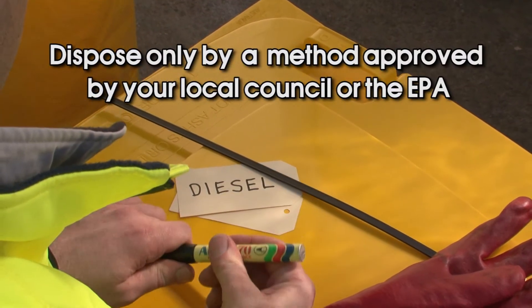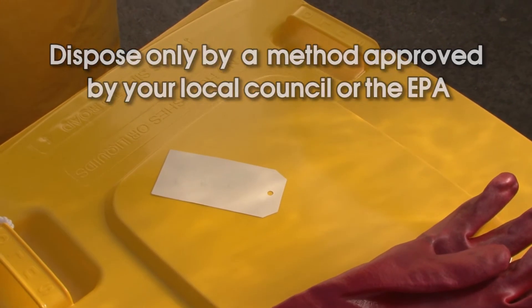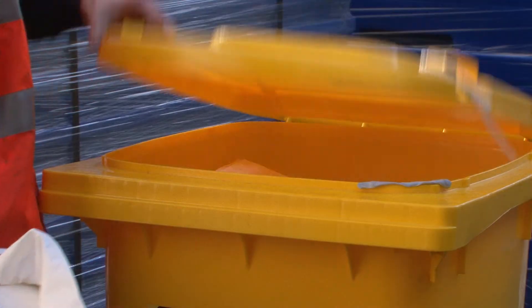Remember, you should only ever dispose of contaminated material in a method approved by your council or the EPA. All soiled PPE should be disposed of correctly and replaced, or cleaned and returned to the spill kit.